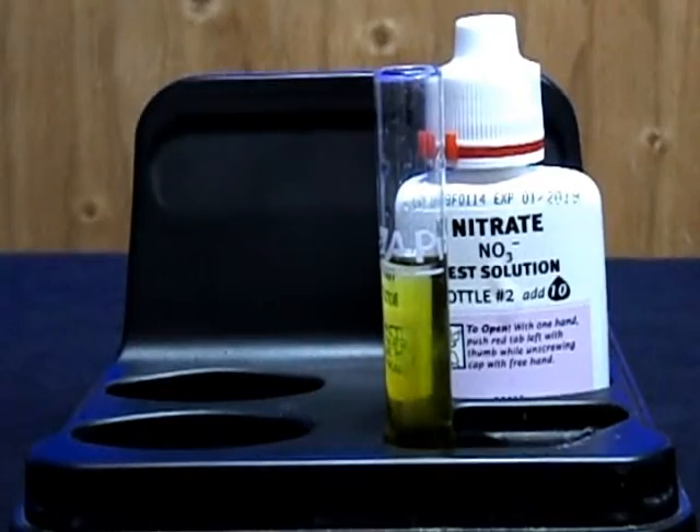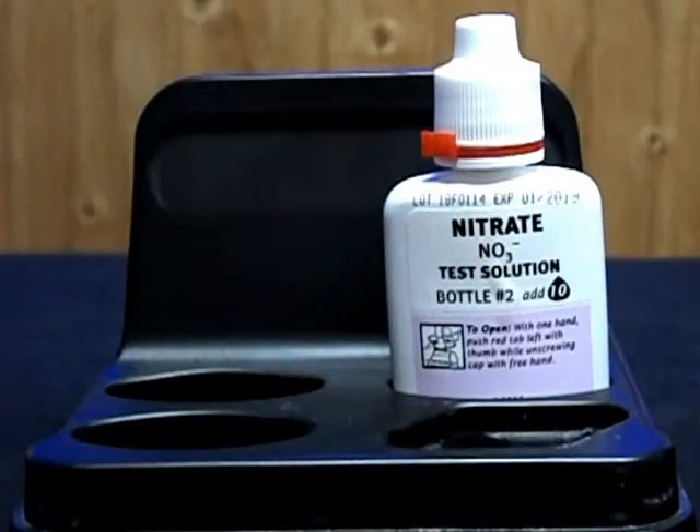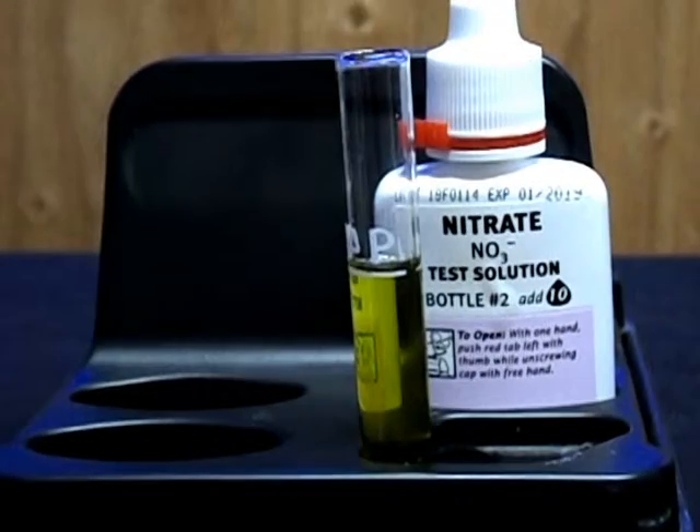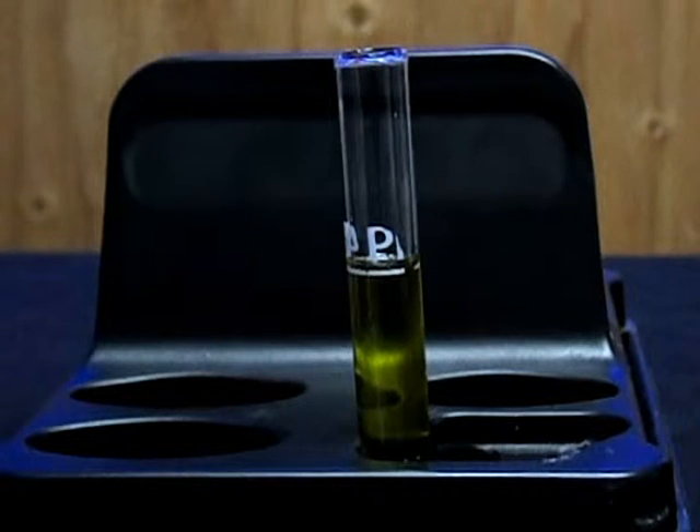Then you just want to cap it and shake it a little so it's mixed with the water that you're testing. Now step three: you want to shake up bottle number two for 30 seconds.